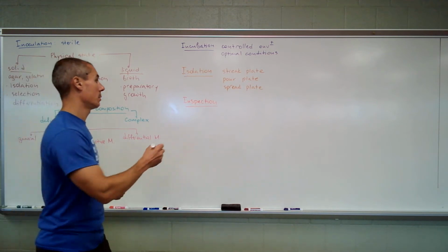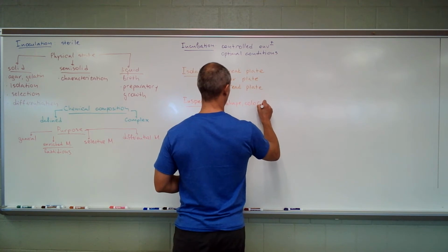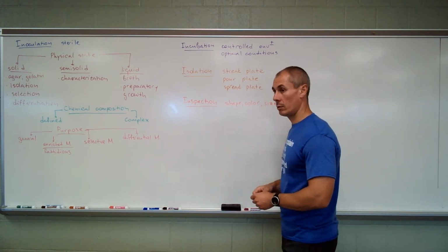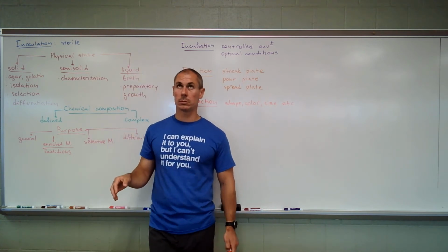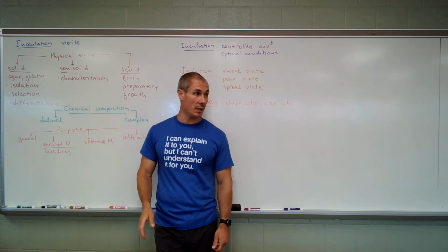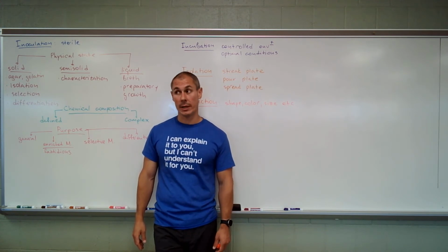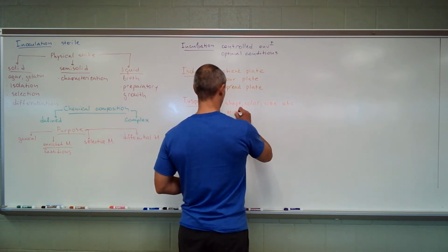Inspection includes things like shape, color, size of the colony. Okay, so you can characterize it like, you know, small, round with entire margin, convex elevation, glossy appearance. So basically you describe a colony. And then you can take your microorganism and put it under the microscope. So microscopy is also a part of inspection.